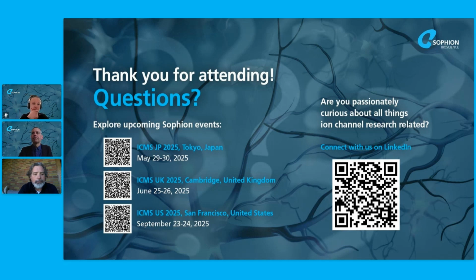Thanks, Scott. So going back to the list, and we're trying to get through as many as we can. We'll try and get to the end of these before the end of the hour. We might stray a minute or two over, but we probably won't be holding you too much longer. So Esteban asks, or even comments at least initially, thank you for the nice presentation. This is probably for Kadla, actually. Just a naive question. Since the vial contains up to 6 million cells, have you tried placing the excitatory cells directly from the vial into the cube instead of culturing them, or is the culturing step necessary for cell maturation, for instance?